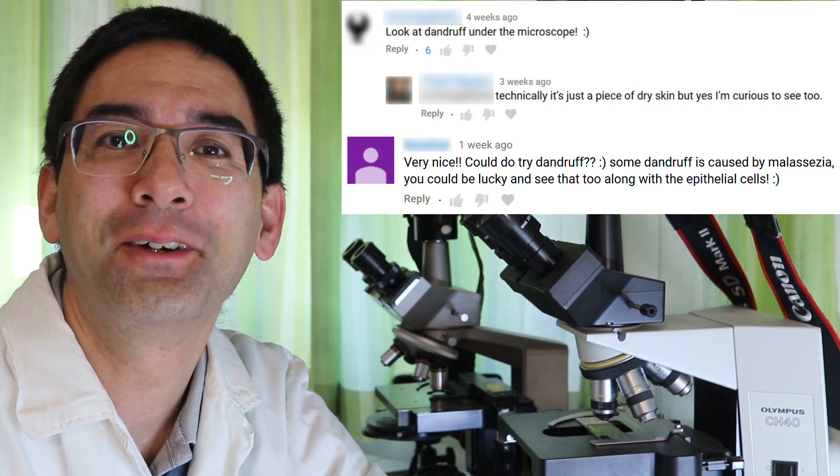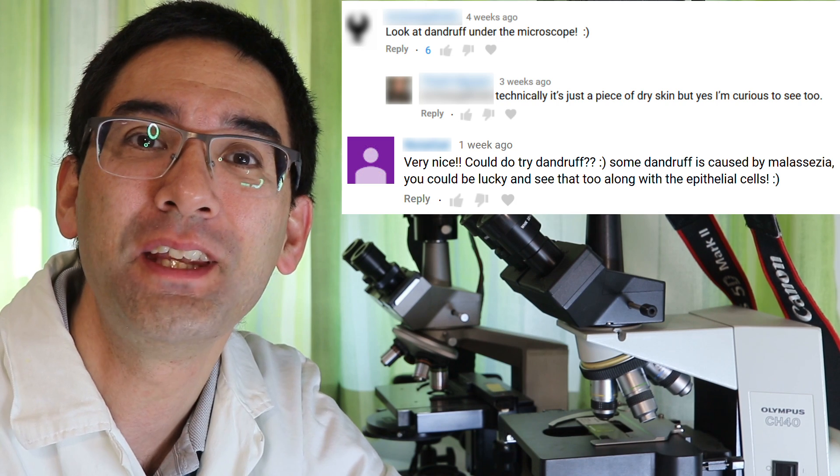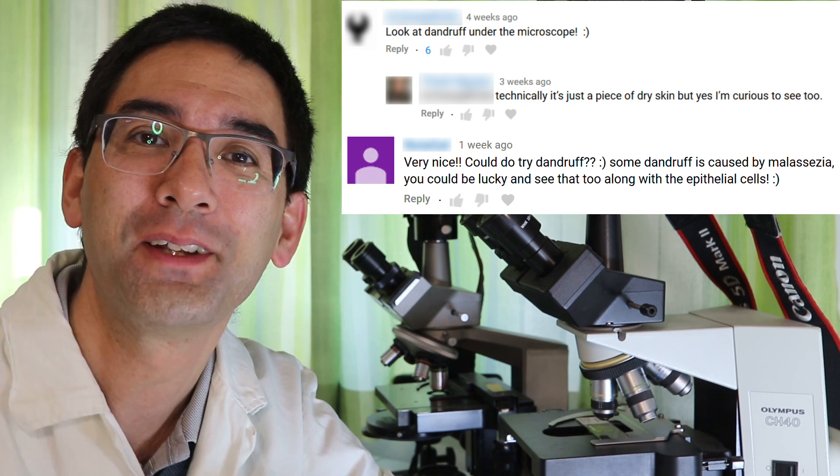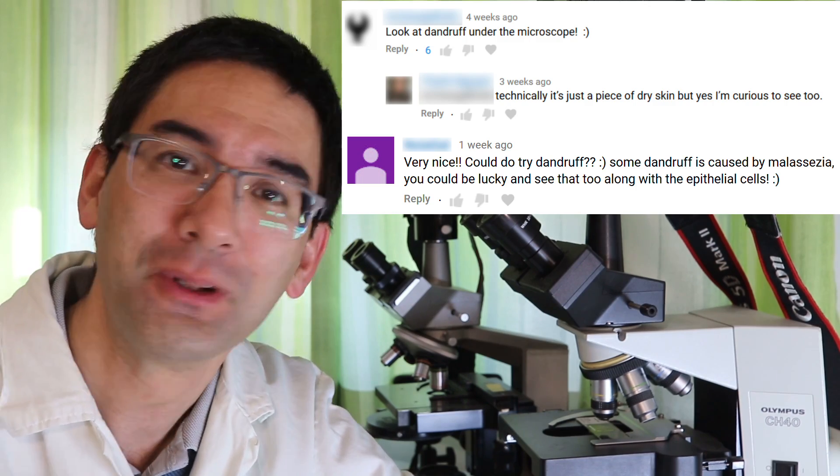Hello and welcome, MicrobeHunter here. People want to look at dandruff. I've received a few comments requesting that I put some dandruff under the microscope. So let's get started.